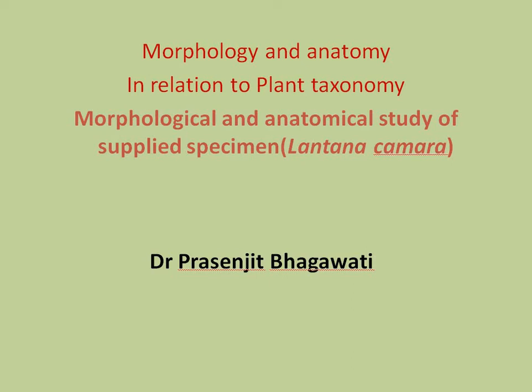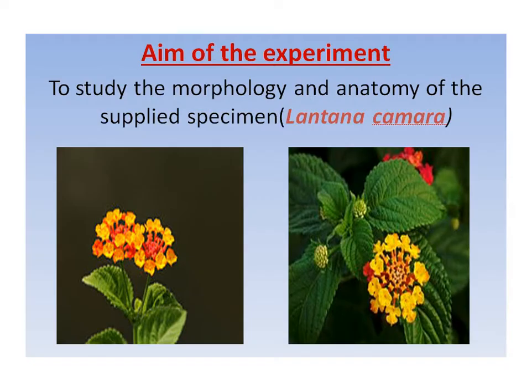Morphology and anatomical study of supplied specimens, that is how morphology and anatomy are used in taxonomical problems. So here the aim of the experiment is to study the morphology and anatomy of the Lantana species.